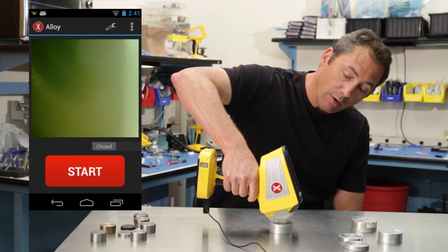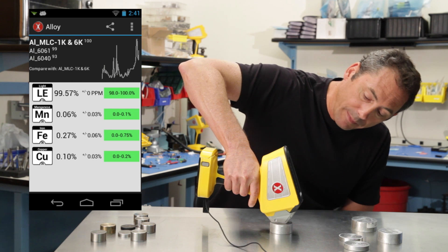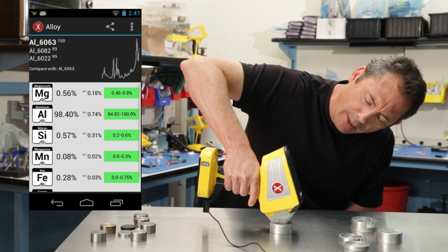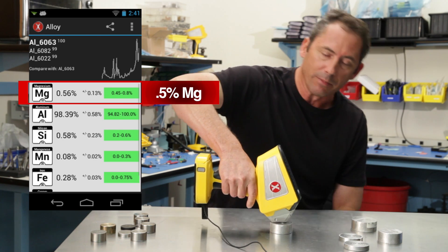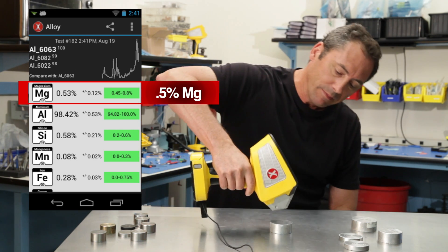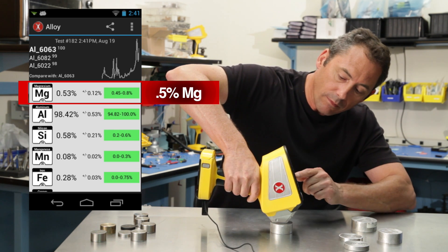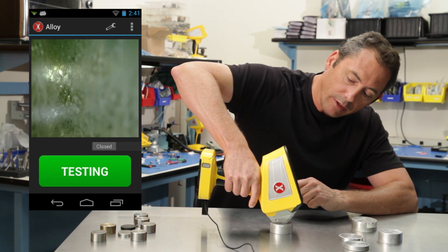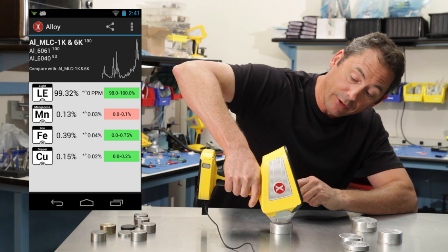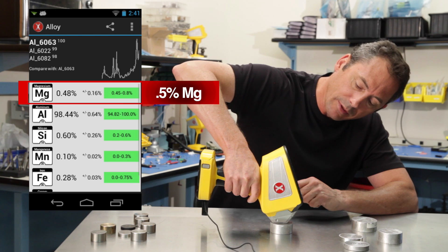Here we go — I'll put it on there and pull the trigger. Beam one comes up: close, mixed low copper. Now it flips to beam two, and in a few seconds there's your magnesium. That was done in about seven seconds — there's your half-percent magnesium. Let's do it again. Pull the trigger: first couple of seconds it's a mixed low copper, that's all you can say about it initially. Then in a few more seconds on beam two, there you go — there's your magnesium, all done.